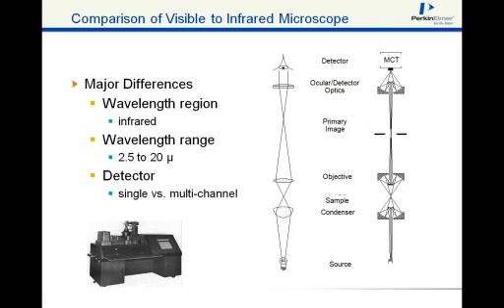And that's taken out for brevity and clarity. We take a normal tungsten light for most visible work. We come through a condenser, which is probably multi-component optical glass, and then to an objective, which is always a complex compound glass objective with coatings on it, up to the eyepiece, which again probably has one or two coatings and some sort of anti-reflection coating, and then at least traditionally up to the eye. Lately it's been to CCD cameras, but your eye is what you visualize most.